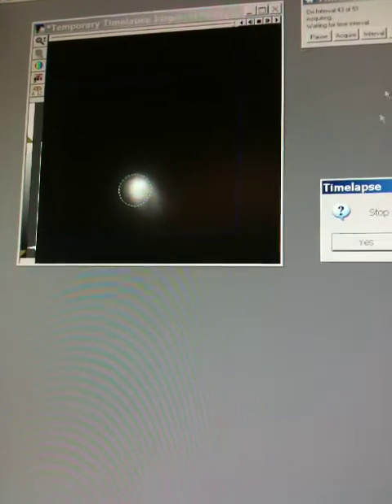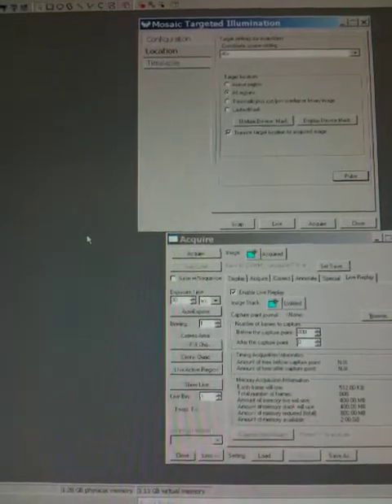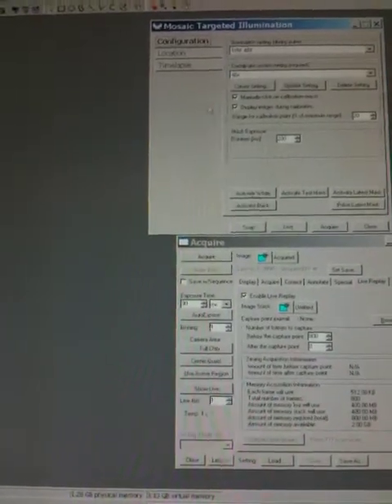So you can see that we are updating our mask, and as we do it, you can actually see it is illuminating there. It's just that it looks like an area where maybe the specimen doesn't fluoresce as much. So what we've just done is we've acquired both a stream and a time lapse using the Mosaic FRAP, and we've dynamically adjusted the regions, as well as changed the shape of the region. So we can draw any region we want.